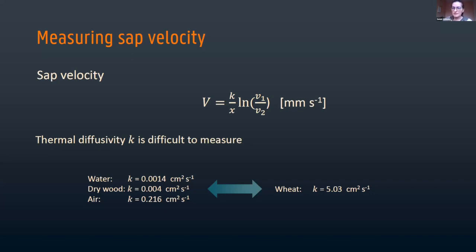And while I could use this value because I calibrated it for flow, which is calculated from the sap velocity, sap velocity was an intermediate value that I didn't really need at that point. But I thought the velocities calculated with this calibrated value were way, way too high. So the goal for the experiment that I did at NEUROMED was to validate these sap flow sensors and at least this parameter value with PET imaging. Because the idea was with PET imaging, I can visualize the sap flow and just look at how fast it goes.